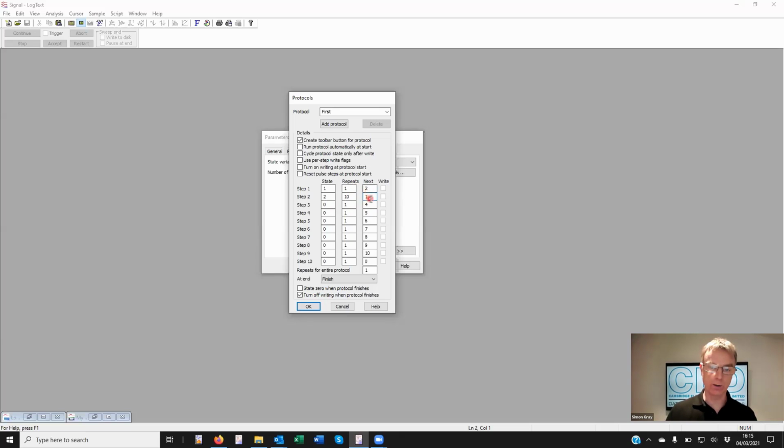Similarly, you could also keep going and use up all your steps, doing different states for different numbers of times in a very specific way. What you can't do is jump to a random step. So randomization is better done by other methods. You could, if you had a reasonably limited number of steps you wanted to randomize them in advance, and then type your order in at this point, or use a script to insert them. That would give you a repeatable order.